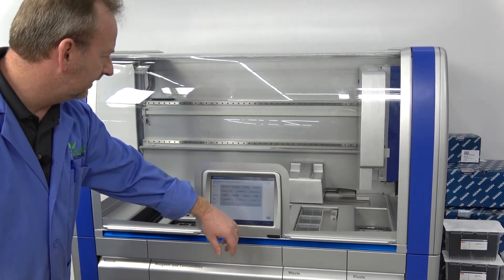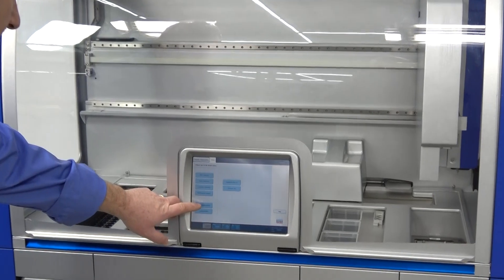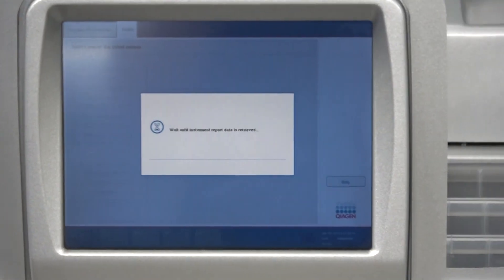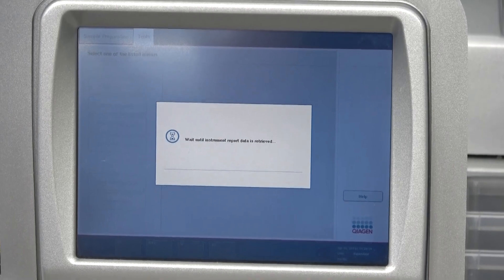We're going to go over to the instrument report, because this is going to give us a lot more information about the instrument itself — specifically the usage on the machine.